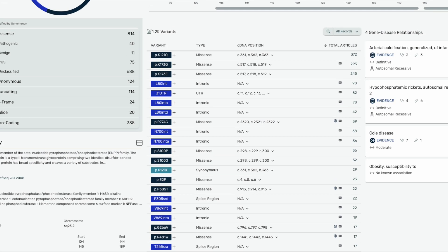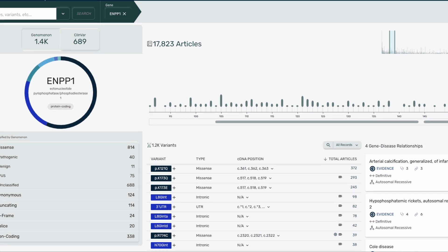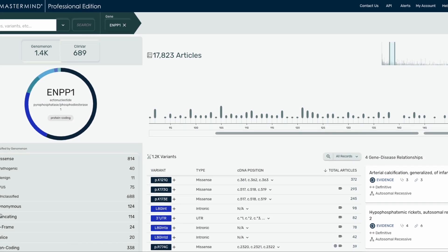Scrolling back toward the top of the page, we have a section for gene disease relationships on the right-hand side. Our curation team develops these GDRs based on ClinGen guidelines. Here we present the disease, the strength of association, the inheritance pattern for definitive GDRs, and additionally we provide functional and clinical evidence for our curated gene disease relationships.